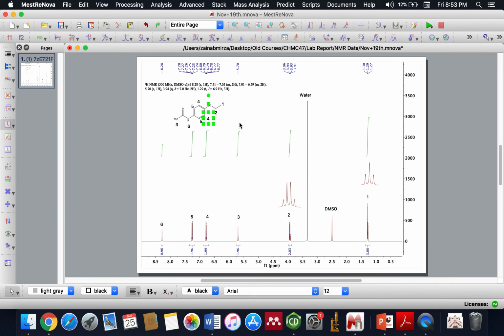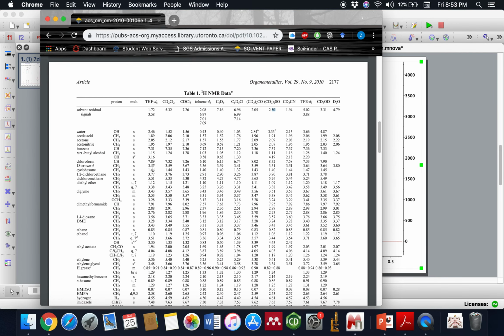Also, oftentimes you will see random peaks. If you're able to identify those peaks as known impurities, for example, ethanol or something like a starting material, the more characterization you can do, the better. If you just label it as an impurity, it'll still get you the marks that at least you didn't leave it unlabeled, but there will be students who are very, very good at characterization. For example, I can help you guys by showing you this table here.